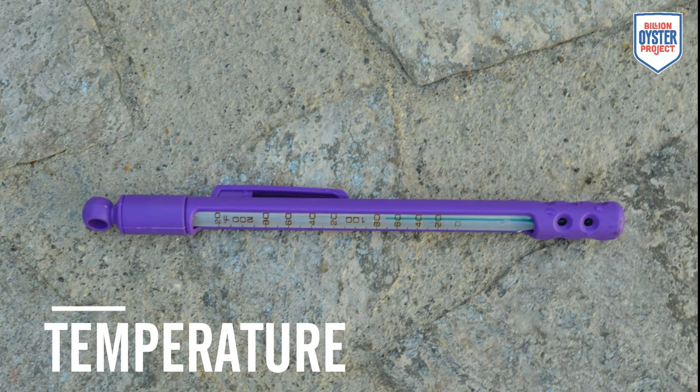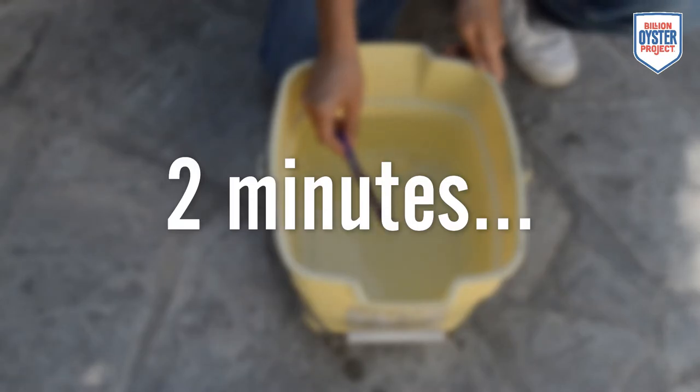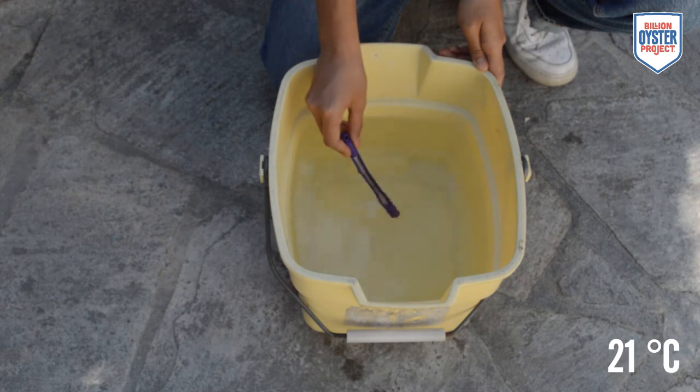To measure temperature, we will be using a thermometer. Place the thermometer into the water and wait two minutes. When reading the thermometer, keep the bottom of the thermometer in the water so that the reading doesn't measure air temperature instead. Read and record the temperature in Celsius.